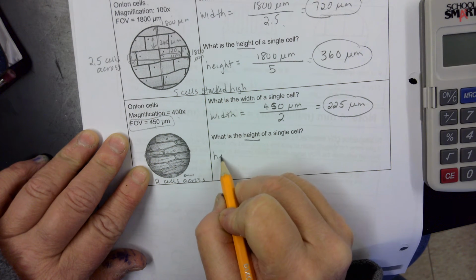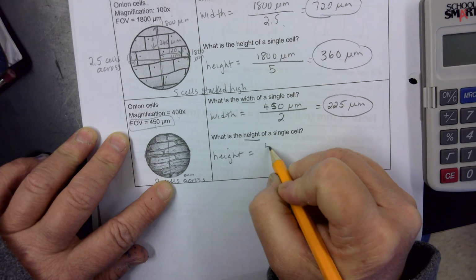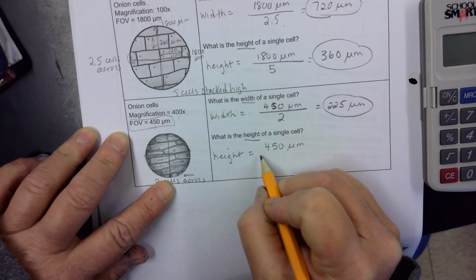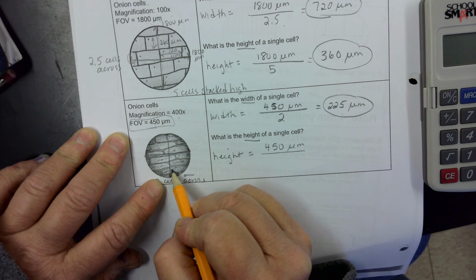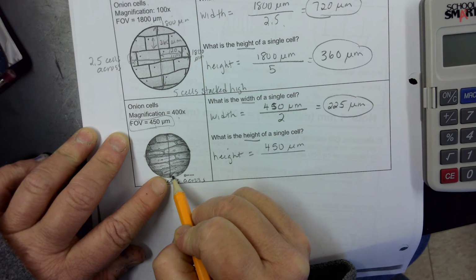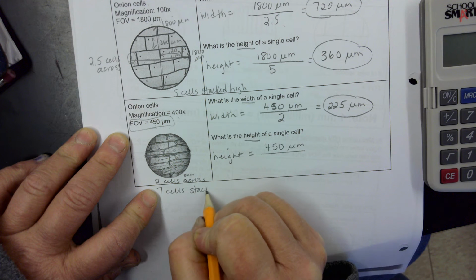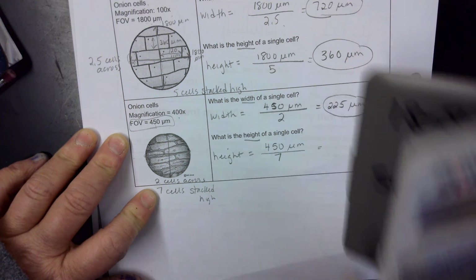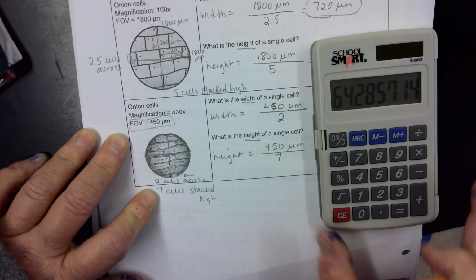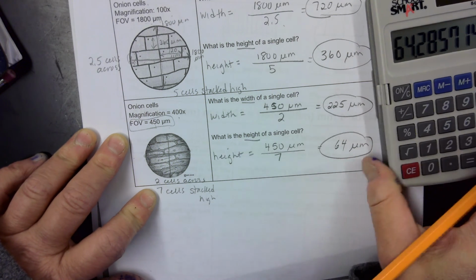What's the height of a cell? Okay, so the height, we still have the same field of view at 450 micrometers. And we can probably fit, let's see, 1, 2, 3, 4, 5, 6 full cells. And if I patch together this part of this cell and this part of this cell, I think we can have 7 cells stacked high. So 450 divided by 7 cells. If we do the math there, 450 divided by 7, we get about 64.